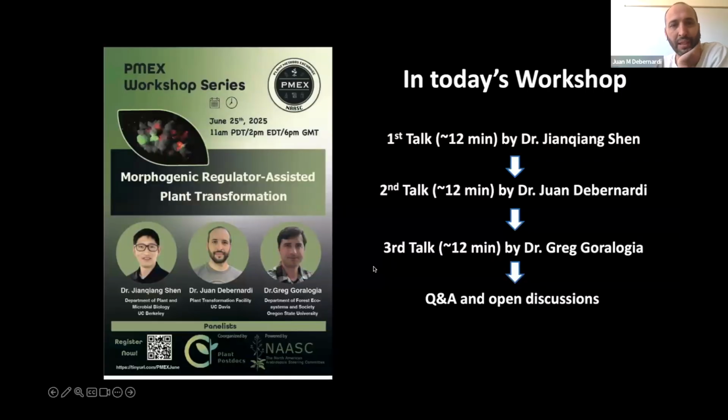Okay. Yeah, that's a very common situation that I observe in our work on wheat and other crops too. Actually, sometimes having a chimeric is quite useful because from one plant you can have a very large population of edits in the T1 population, so it's not always a problem to have a chimeric. Sometimes it's good.